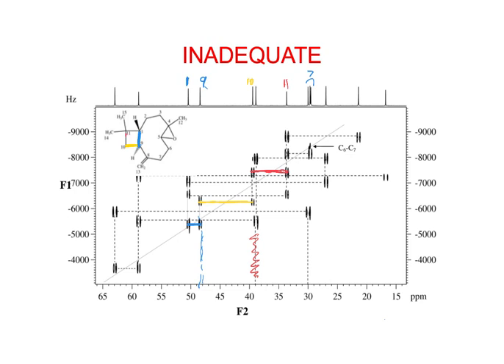Right, so that's 10 to 11. 11 has, look at that, 1, 2, 3, 4 couplings, right? Because it has those 2 methyl groups on there as well. Okay, so we want to go back to 1, though.